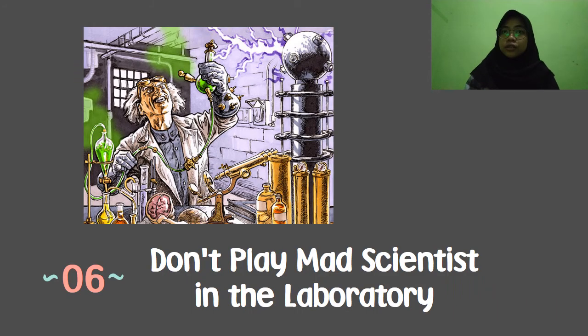Do not randomly mix chemicals to see what happens. The result could be an explosion, fire, or release of toxic gases. Similarly, the laboratory is not the place for horseplay. You could break glassware, annoy others, and potentially cause an accident.